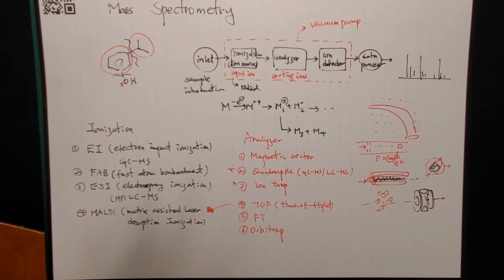So ideally, you can think of these things for biologists, right? If you want to sequence, say, a protein, you can have a certain protein segment fragmented, or a single amino acid get out, and you see what was there.